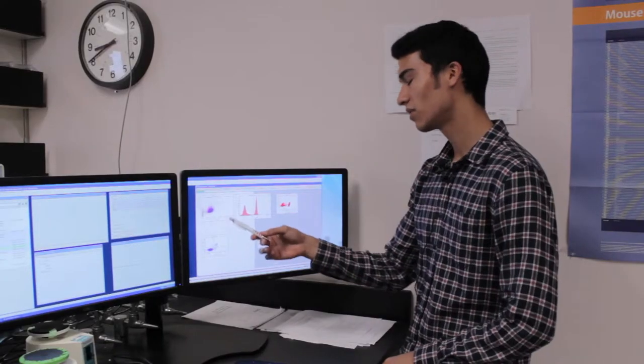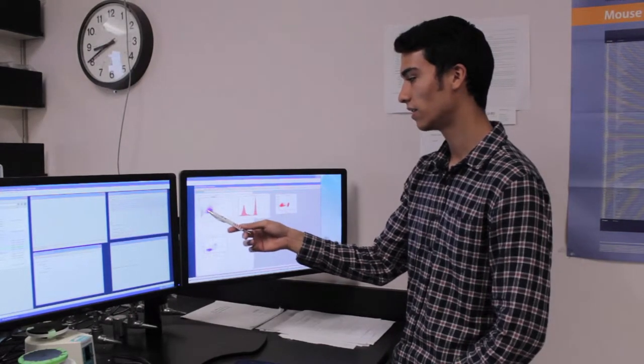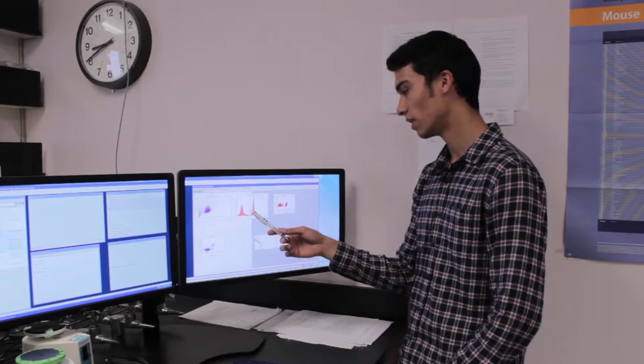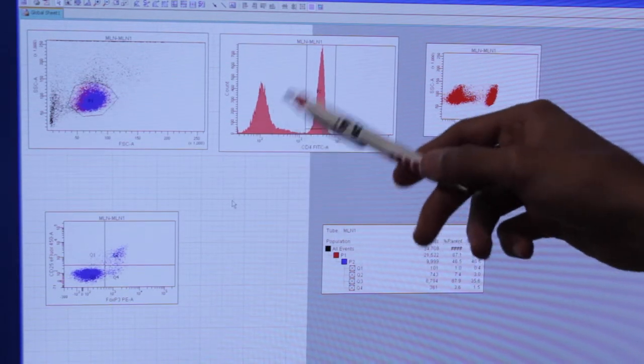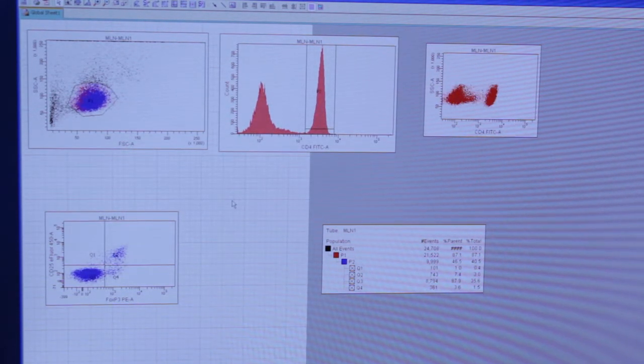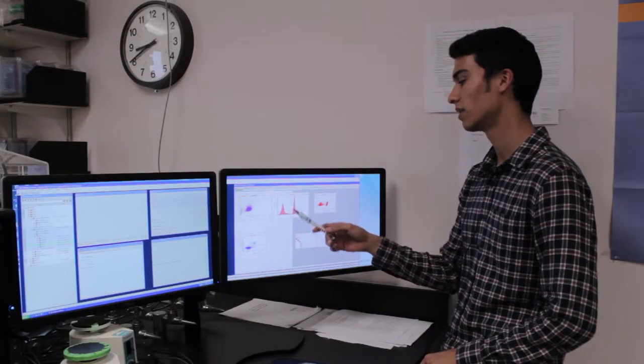After everything is completed, you will be able to see your results in the form of several graphs. In this graph, for example, you are able to see the concentration of dead and alive cells, whereas this graph tells you the number of unstained cells as opposed to stained cells.